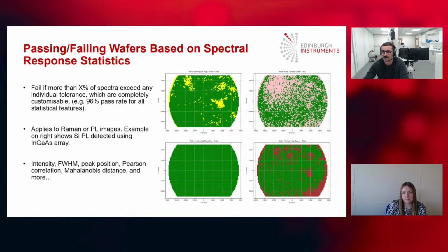So what it's telling me is that the band gap didn't change, but there's something else going on in the spectra that is causing peak width changes, and we'd need to explore the PCA a little bit more to know what's going on. But these chemometric ones are really good for things like contaminants. If you're not looking at a specific peak, you just want to look at how the whole spectrum changes versus the mean, then you would use this. So this is a very sensitive method for ensuring uniformity and quality at scale.